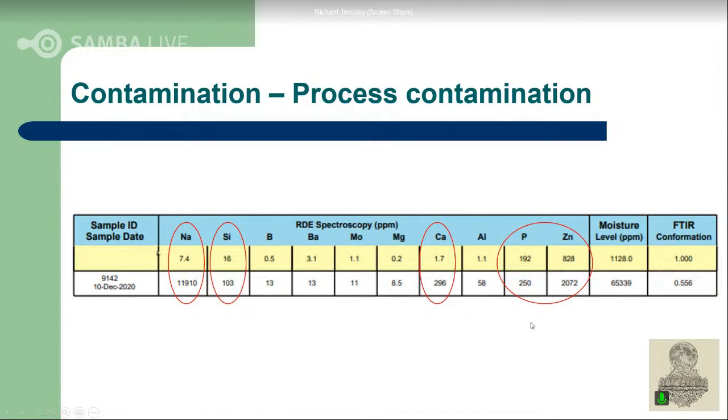We had first thought this might be due to grease mixing, and then we found out some more information about the area that this piece of equipment was working in. And we actually got the feedback that the elements we were seeing increasing were present in the room, and that they were ingressing into the bearing, which caused the issues, and eventually caused the failure of it.